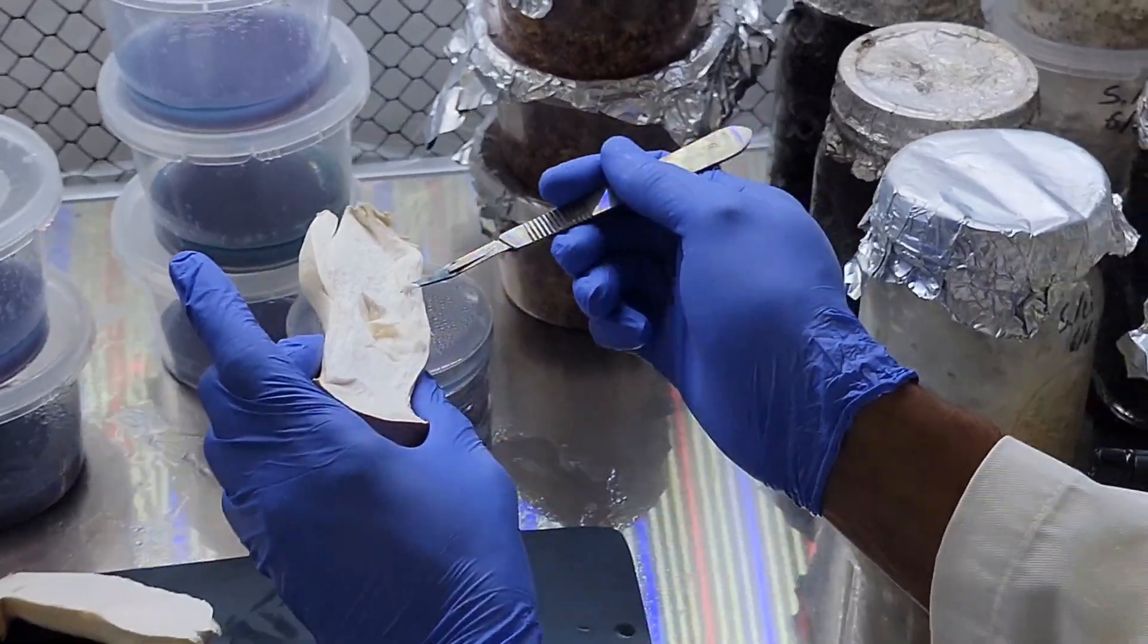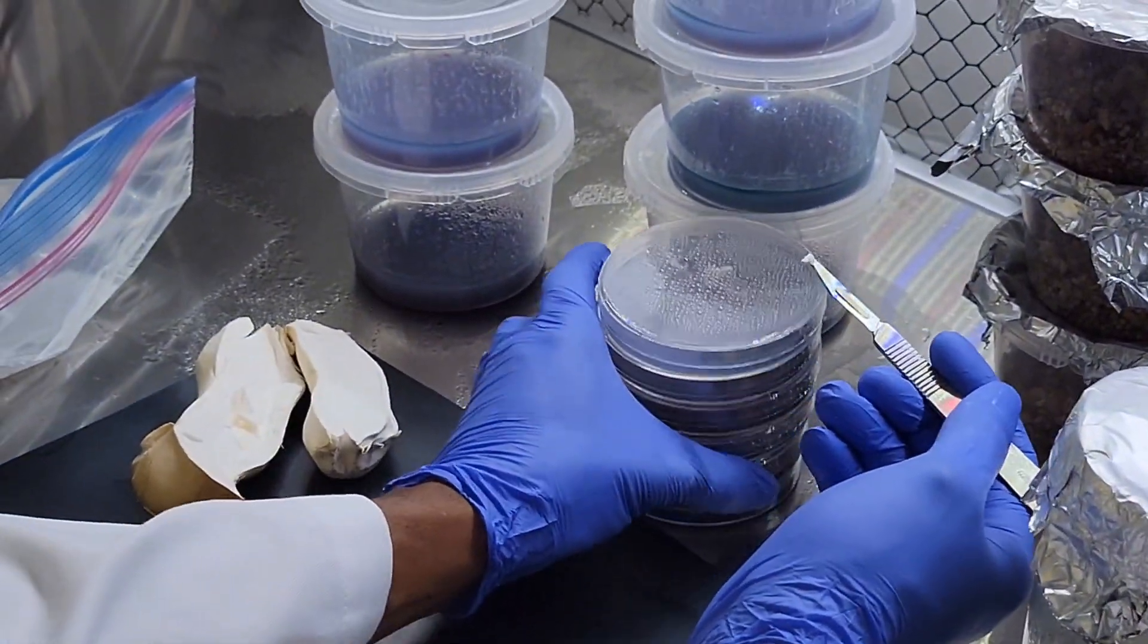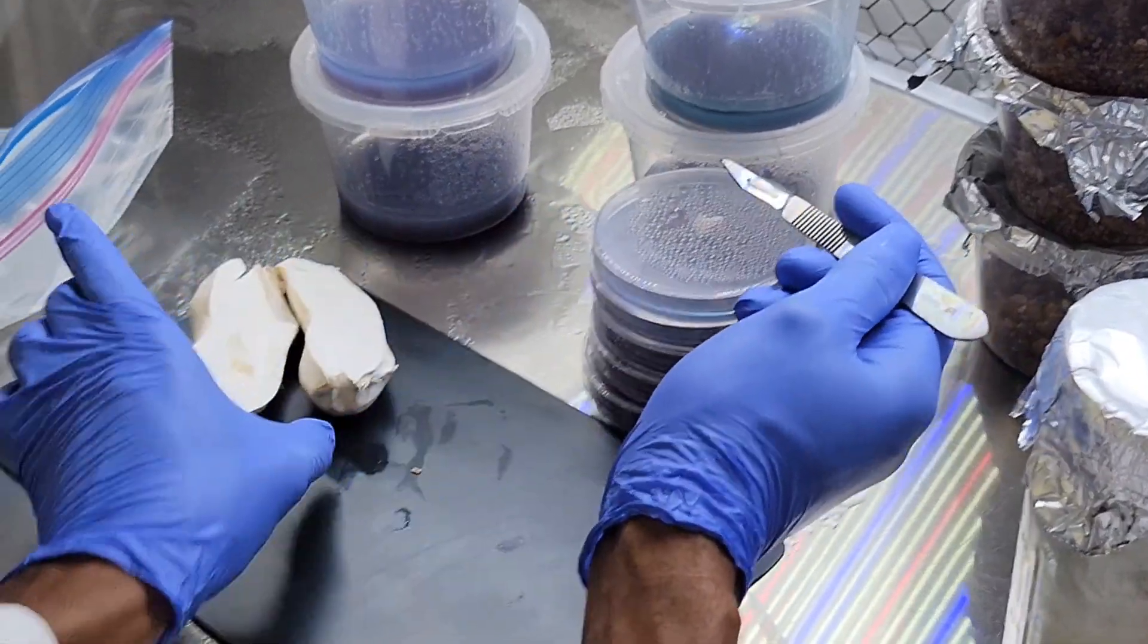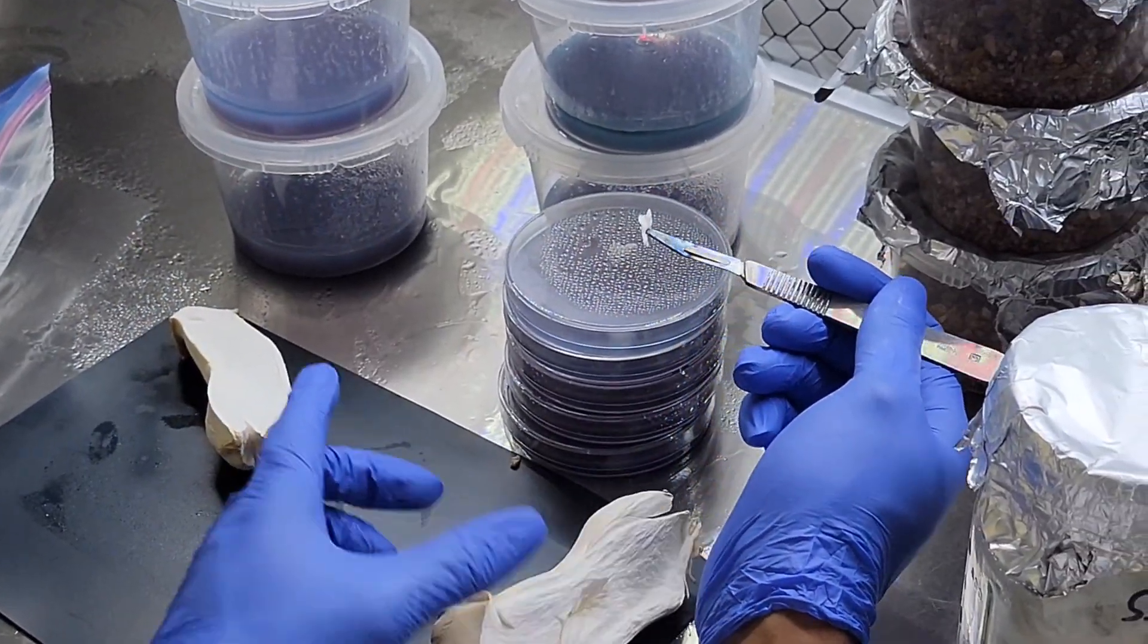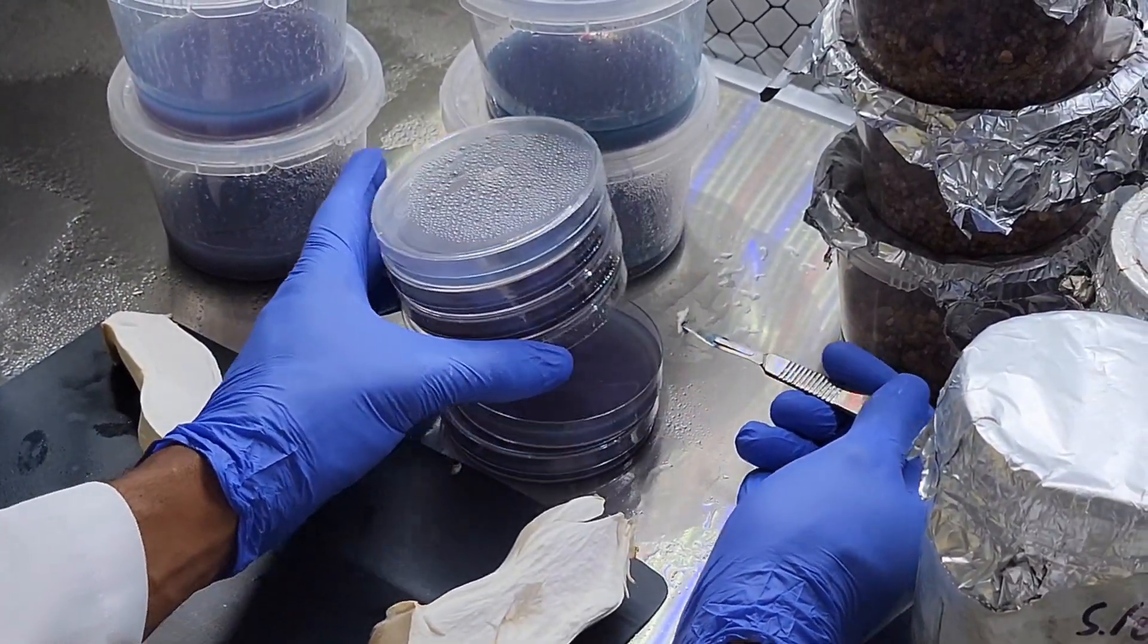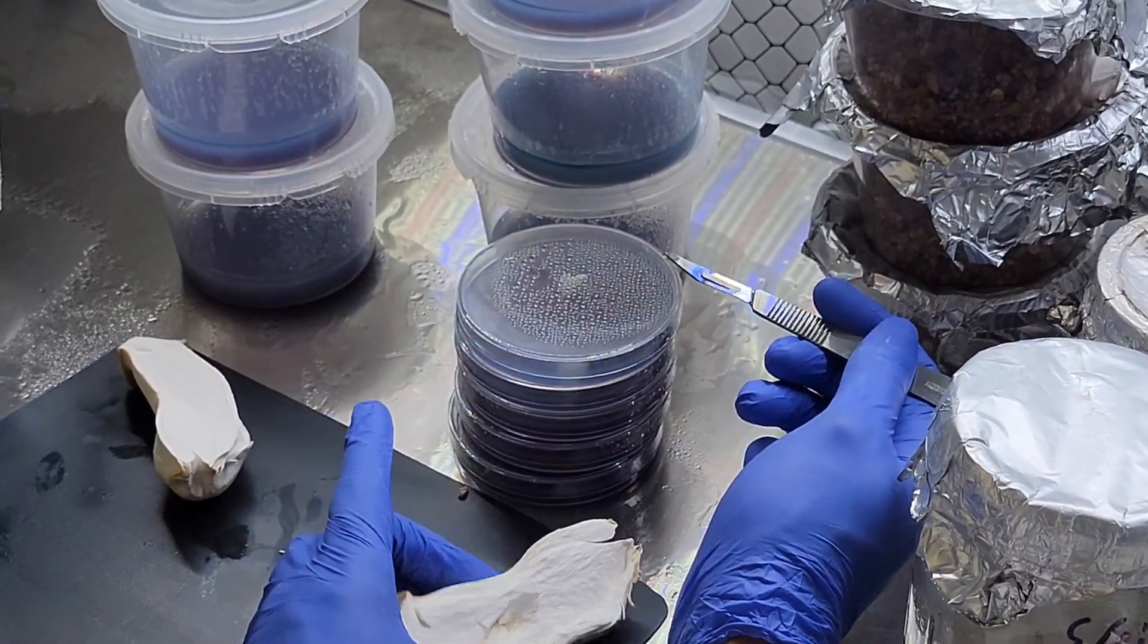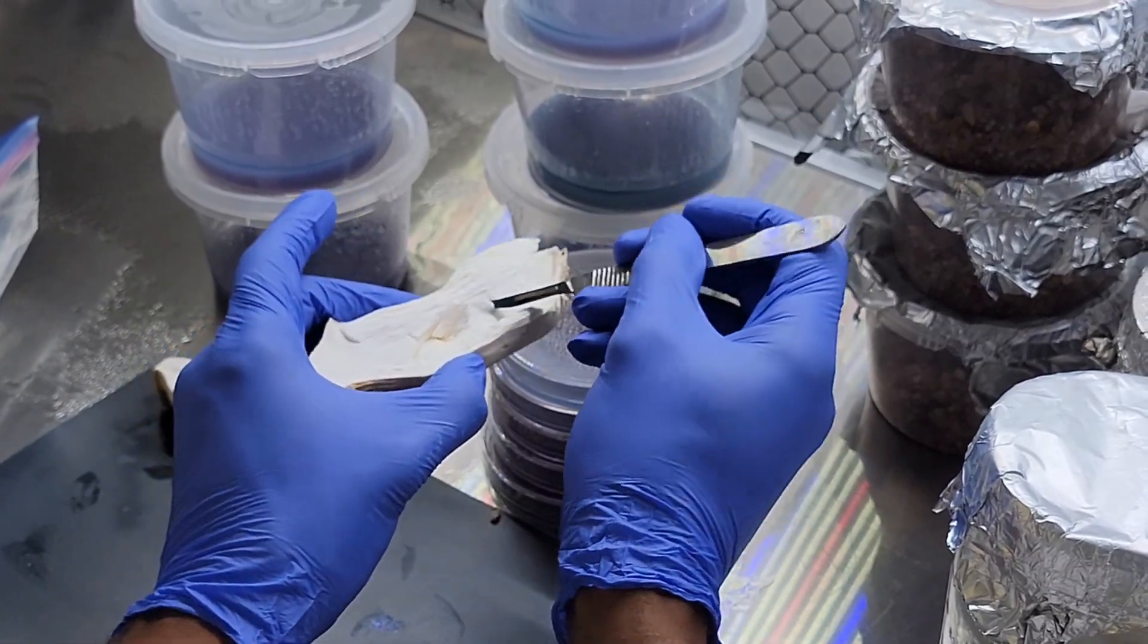You'll just transfer out anything that you identify as mycelium coming from the sample away from whatever else may be growing on the plate, and you'll do that over and over again until you have a fully clean plate. And that's when you can either slant away your specimen for later or move it to grain.